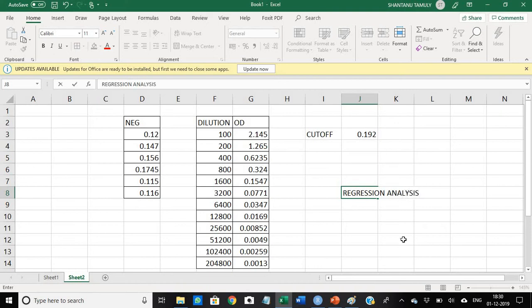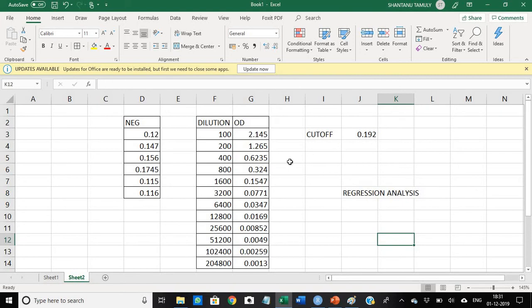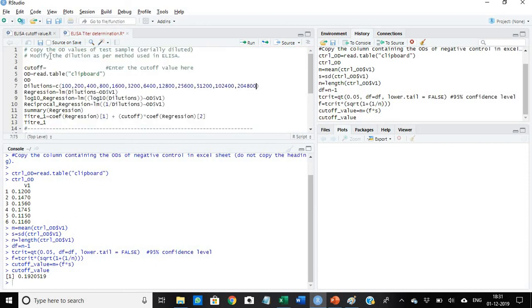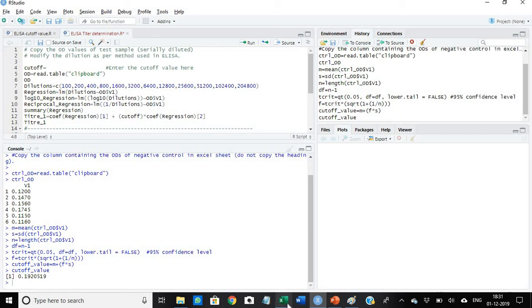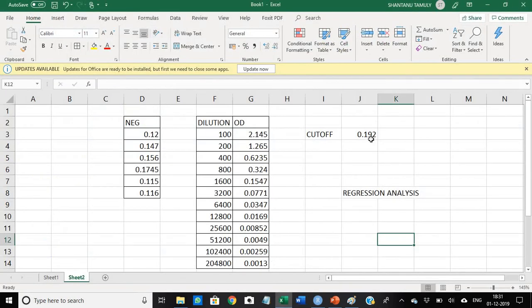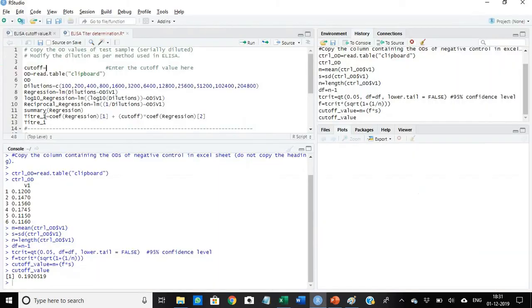We use the regression analysis. For this we go to the R program. For this I have developed one R script. In this R script what is to be done, you see, one cutoff value. You have to write the value of the cutoff. If I go back to my Excel sheet, our cutoff value that we determined by earlier R script was 0.192, so I would add it here: 0.192.